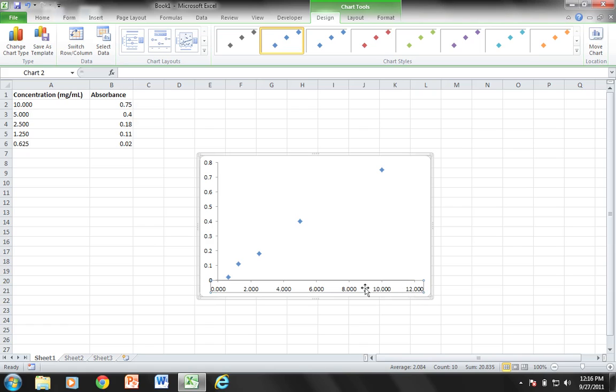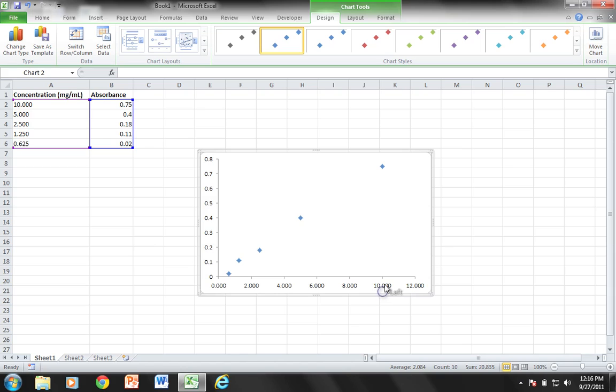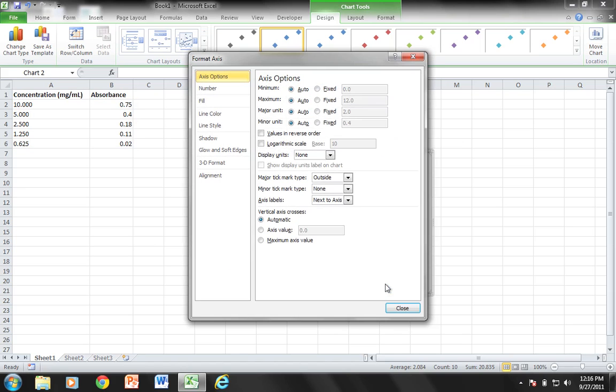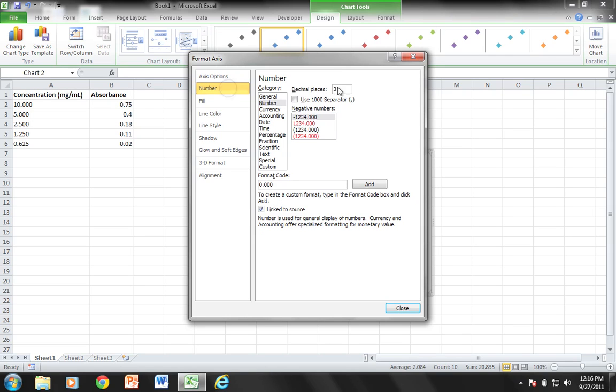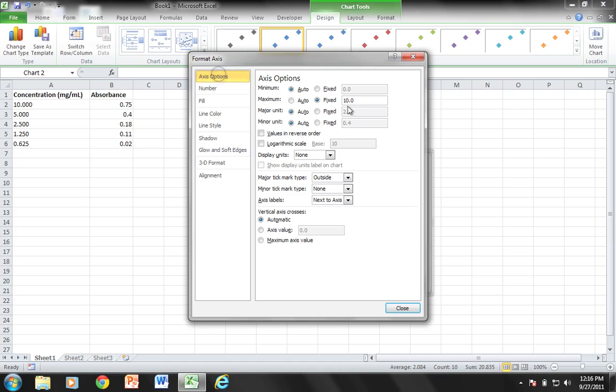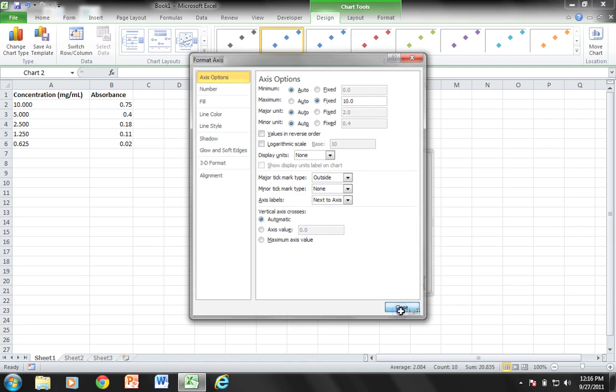I'm going to right click on this one, and after I choose format axis, I'm going to choose a fixed value of 10. For my number, I'm going to put zero decimal places. Just double check my axis options—I'm going by major units of 2 which I'm fine with, so I'm going to close that up.